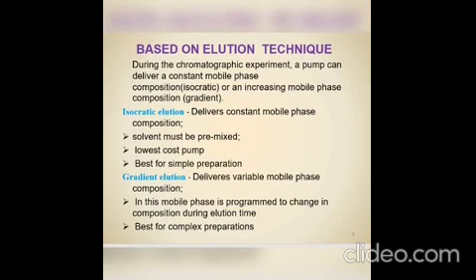Elution. During the chromatographic analysis, if the pump delivers a constant mobile phase throughout the analysis, it is known as isocratic elution. If in the middle of the runtime you change the composition of the mobile phase, it is known as gradient elution. The gradient elution technique is used for complex mixtures.